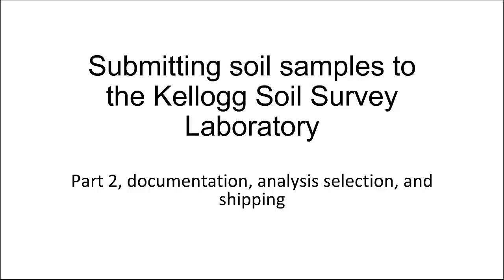Yesterday's seminar covered sampling, actually field sampling techniques. Now that we have covered the sampling aspect, today we're going to talk about the documentation you need to get your samples into the laboratory system, analysis selection, and shipping of samples. We're going to start off with the documentation, and Ellis Benham, Larry Arnold, and Henry Ferguson are going to cover the other topics.